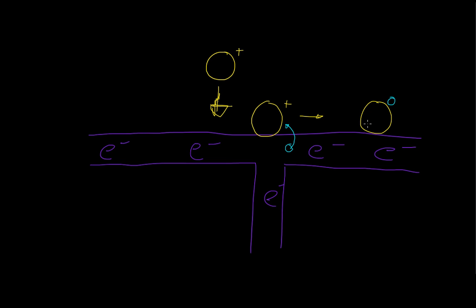So when this happens, when this electron moves, these electrons in the wire flow for a tiny, tiny, tiny bit. And an electron flow is electricity. So when our molecule hits, we can measure a small bit of electricity. And obviously, the more molecules hitting will produce a stronger charge.